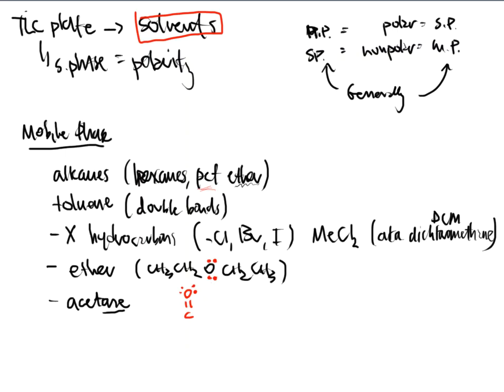If you're looking at acetone, that's basically 2 carbons, so we're not talking about a lot of carbons here at all. So we're limiting the carbons and we're increasing the double bonds and the electron pairs in a molecule. So it becomes more polar.